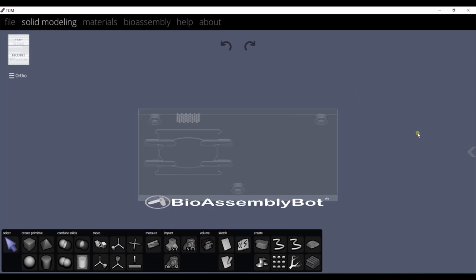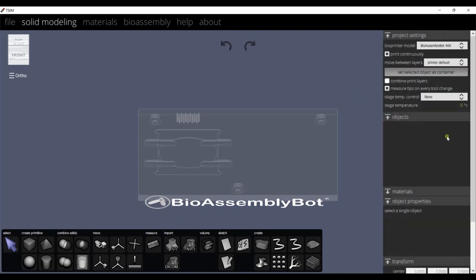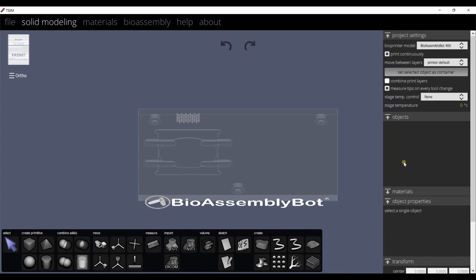Click on the right arrow here to expand options. First are the project settings. Choose the bioassembly bot printer model here and the other printing options as needed. The biomaterials lab has bioassembly bot 400 model, and we can leave the other options as default values. Here we have an option to control the stage temperature we can enable if needed. The object material and object properties can be modified after creating or importing a 3D object.